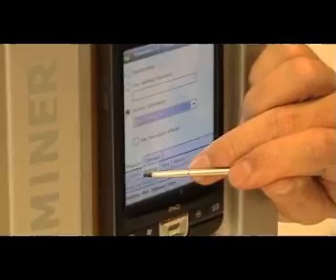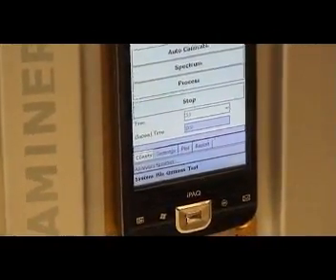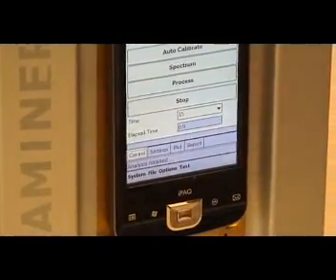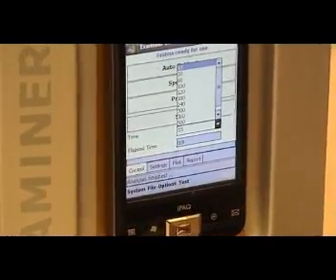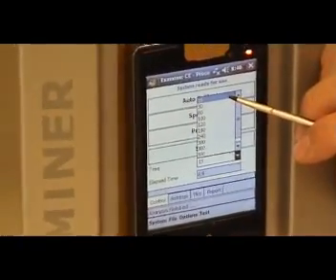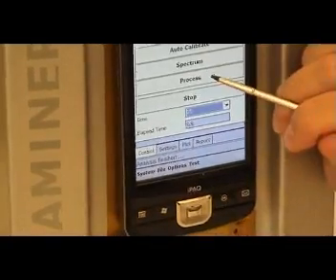Then we go again to control and we choose the analysis time. For the speed of this demonstration, I will use an analysis time of 15 seconds. Normally we say measure around 30 to 60 seconds to have the best results, but here let's go to 15 seconds. Then the only thing you do is push process.